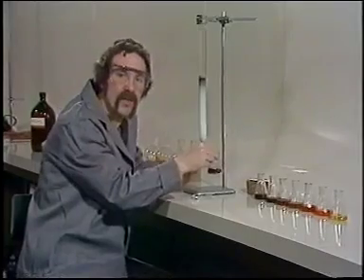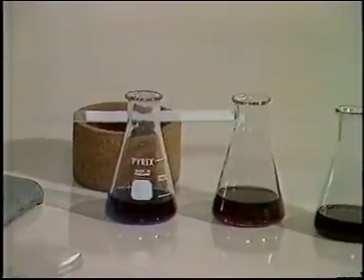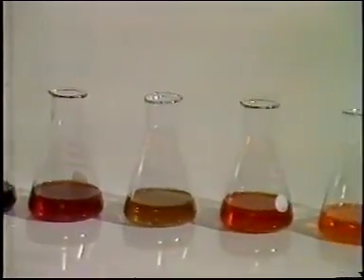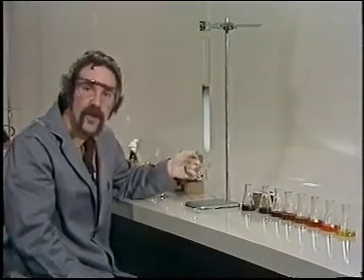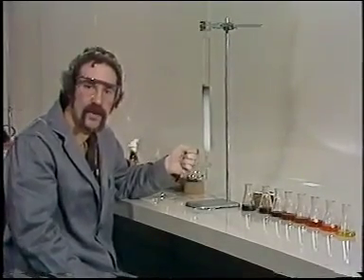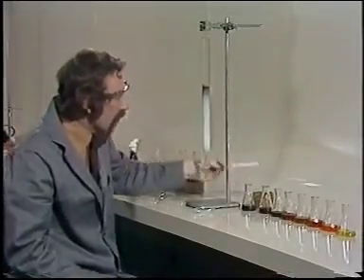The column is now exhausted. This is the last fraction. And you can see we have quite an impressive array of fractions here. But has the column done its job? Do we have single substances in each of these fractions? Well, one way to tell would be to see whether compounds will separate on TLC.